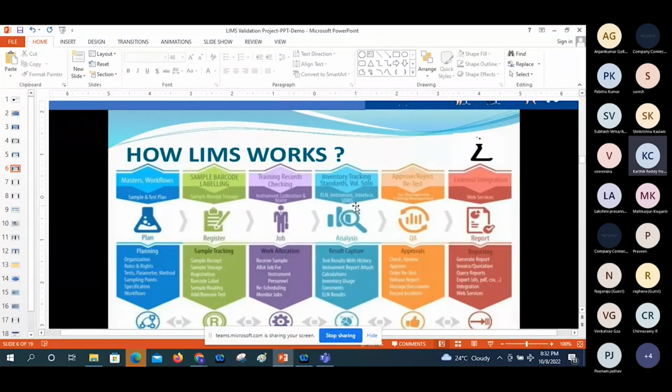SDMS is nothing but a scientific data management system. It would be like data archiving, and backup and archiving the data. It is from Waters Corporation. So whatever the data is generated from the particular instruments, whether file based or whether it is HPLC or GC, whatever is there, those kinds of data can be archived. So we need to put the archive into a specific application like a scientific data management system, so the data can be available for a long period, and the data can be tracked to any person.